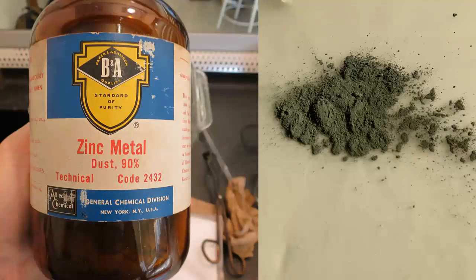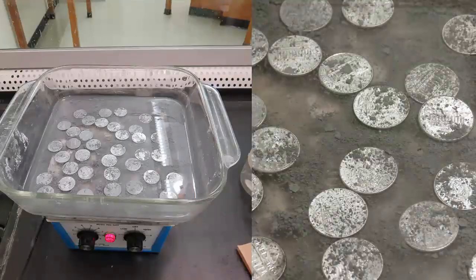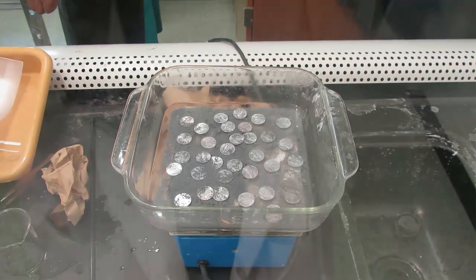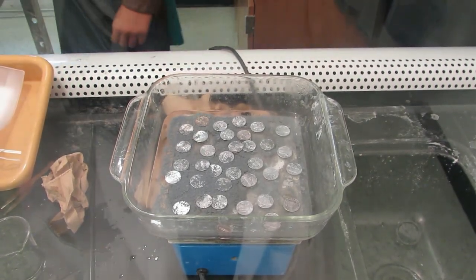Once our sodium hydroxide pellets have dissolved in the water, we can add zinc powder. That zinc powder is also going to dissolve to some extent, and that's what's going to coat the outside of our pennies. Here we have our hot plate with our pennies and the solution of sodium hydroxide and zinc powder dissolved in the water — that's what's coating the pennies. It only takes about 15 to 30 minutes for the pennies to be covered in zinc. The hot plate is really useful because it speeds the whole process up.